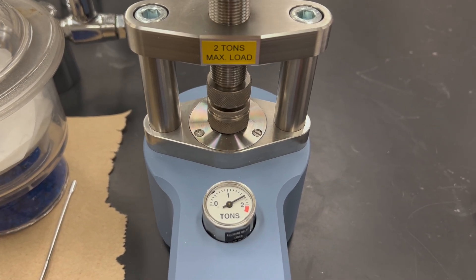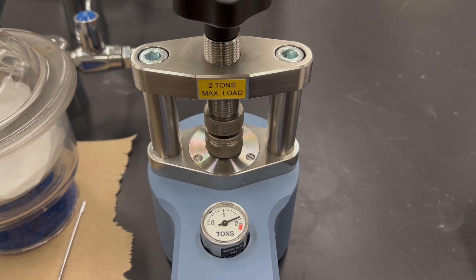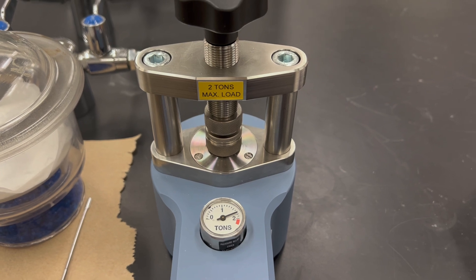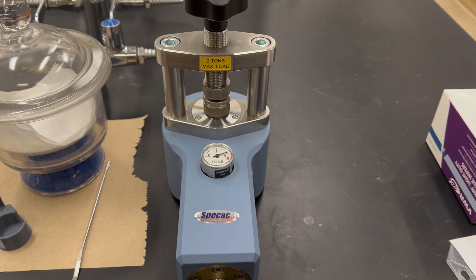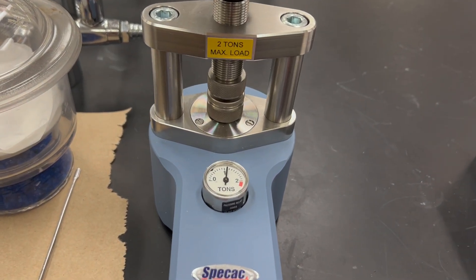You want to go until it reads about 1.7, 1.8 tons. Don't go over two tons; that could break the whole thing. But you go to about 1.8 and then you just let it sit there, and this is actually melting the KBR. Let it sit for about 10 seconds or so.